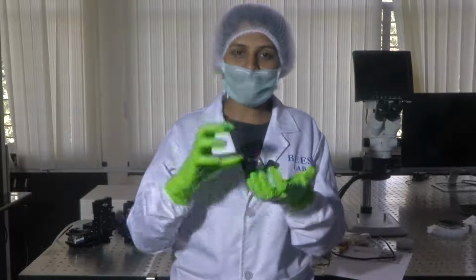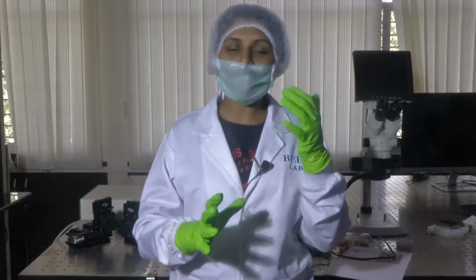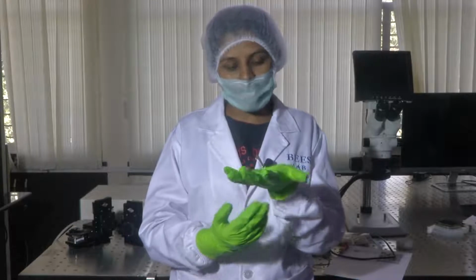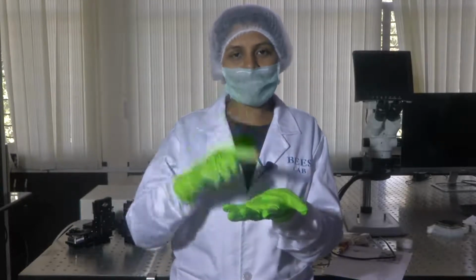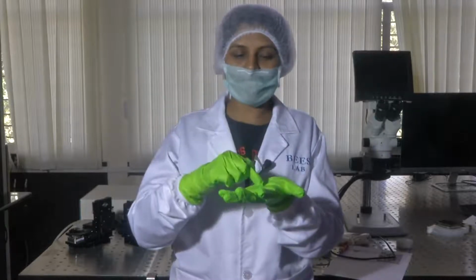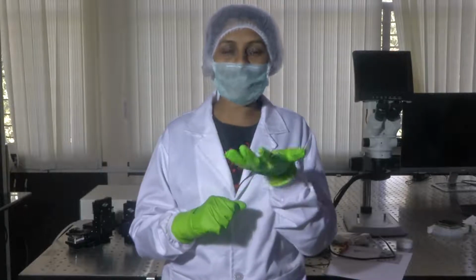When all of these are combined together and plotted, you would actually understand the mechanical properties of tissues. You know the amount of force that you are applying over the given area, and then the amount of deformation can be quantified with the plot the reflected light gives you. So in this way, using optical methods, you could study the stiffness or the elastic properties of tissues.